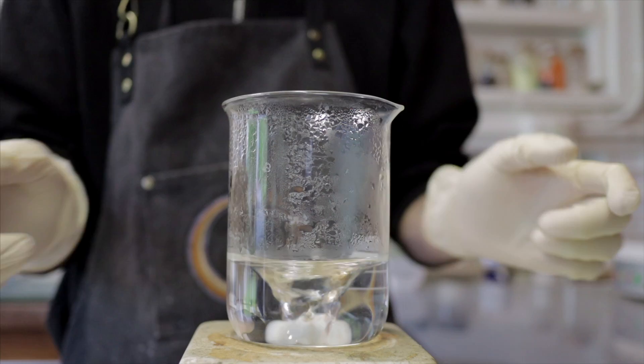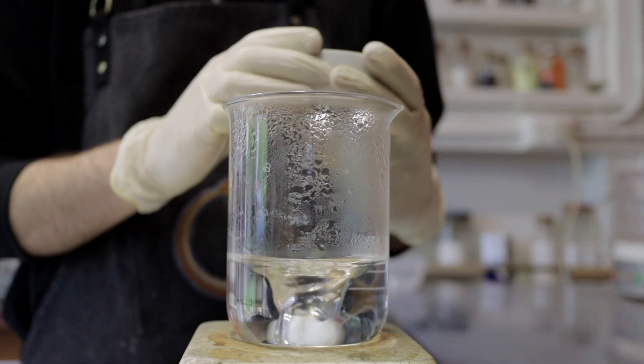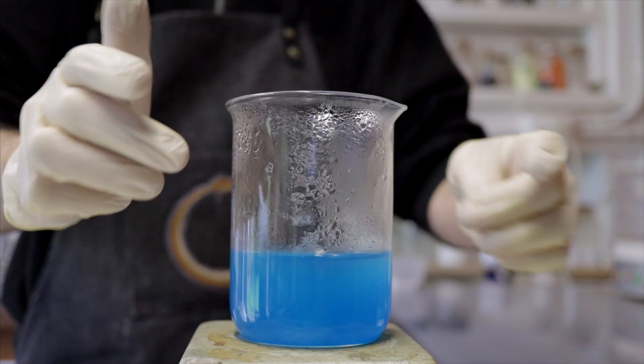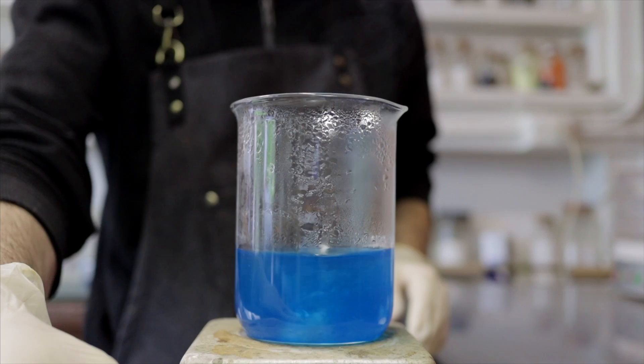First thing we're going to do is make a 10% solution of copper sulfate. We have 200 ml of water here and 20 grams of copper sulfate, and we're going to add that in and stir it until it's dissolved. One of the key features of this process is that we're doing it quite hot — this is freshly boiled water on the hotplate, which is maxed out. The water should be roughly at least 80 degrees Celsius, which means the dissolution will be much quicker. In fact, it's almost immediate and we get a nice clear blue solution.